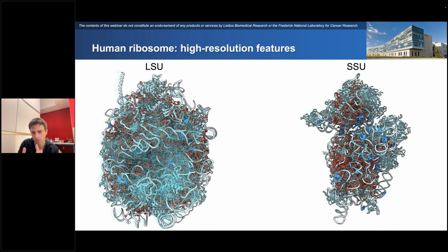So now you see it when you start with that bare skeleton where you just have the sequencing, just have the register down. As you get higher in resolution, it becomes completely decorated with much more information than we had at the start.